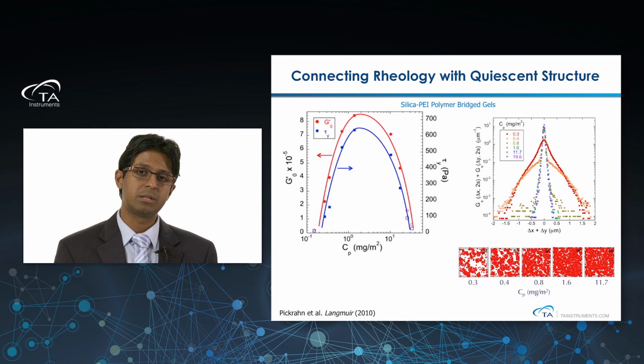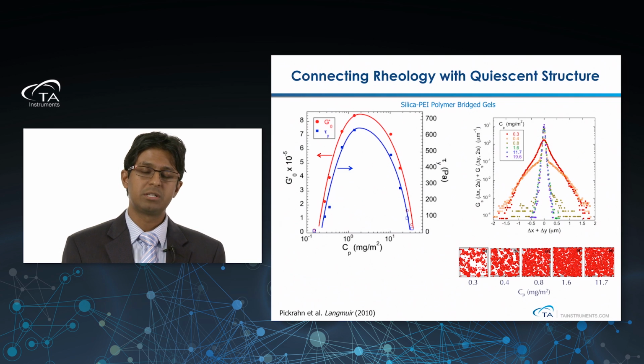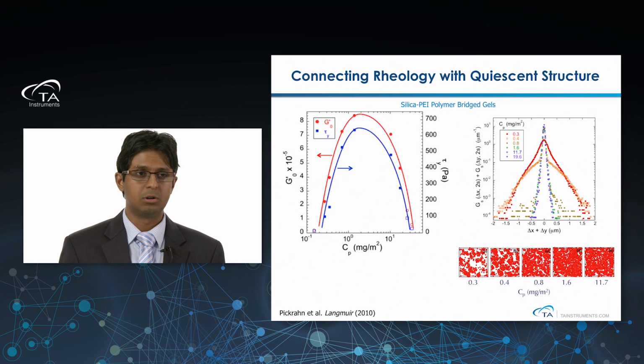As we start to increase the polymer concentration, we see this more pronounced bimodal behavior. And beyond a certain point, adding additional polymer only serves to accentuate the arrested behavior, meaning all of the colloids that are available in the sample are now getting arrested and forming this gel.